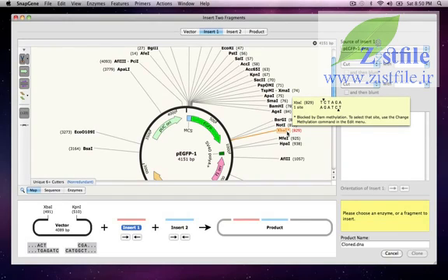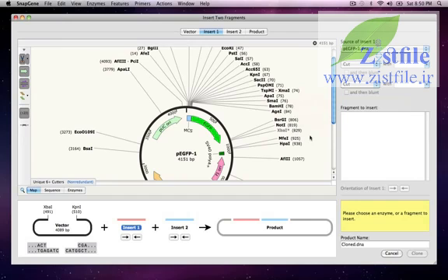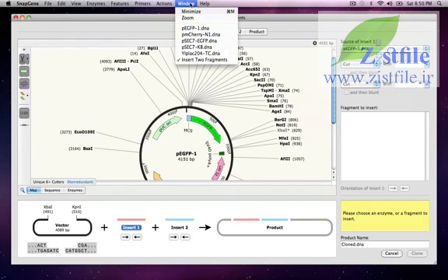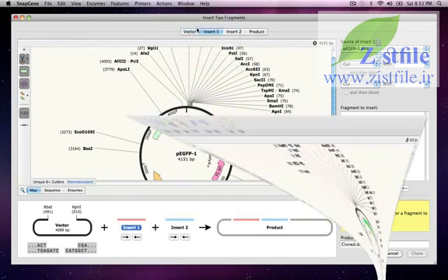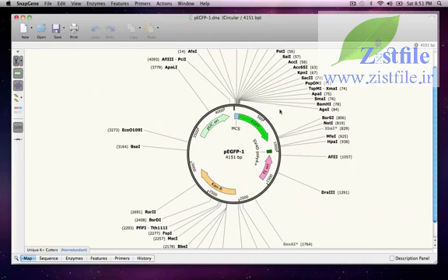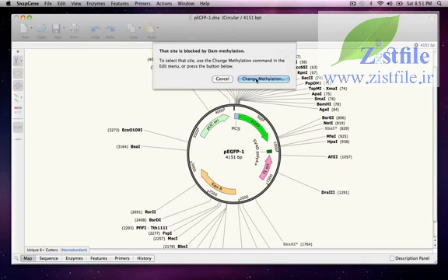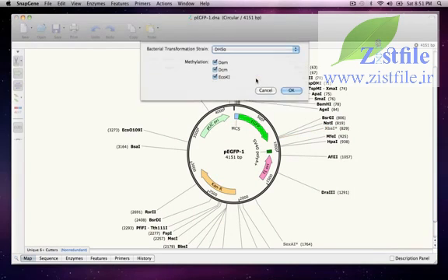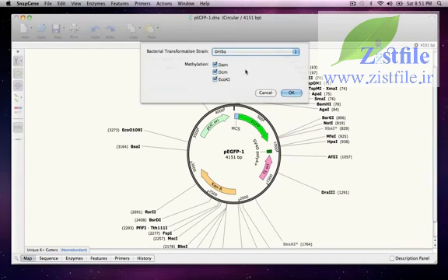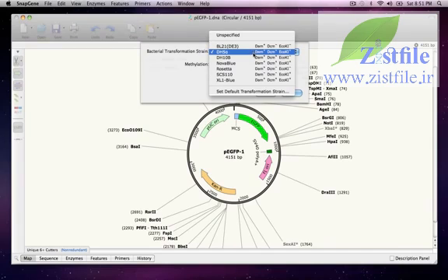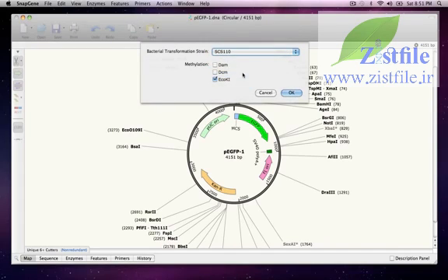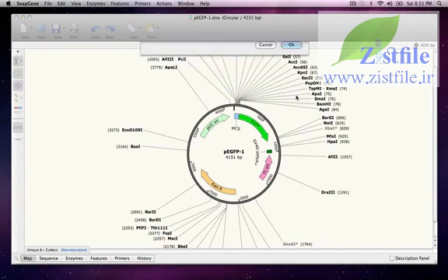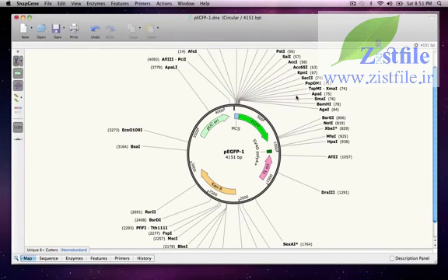To make the XBAR1 site available for cloning, I'll pull up the window for PEGFP1. When I click on the XBAR1 site, it gives me an option to change the methylation. I'll choose the dam minus strain SCS110. When I press OK, the XBAR1 site is now active.